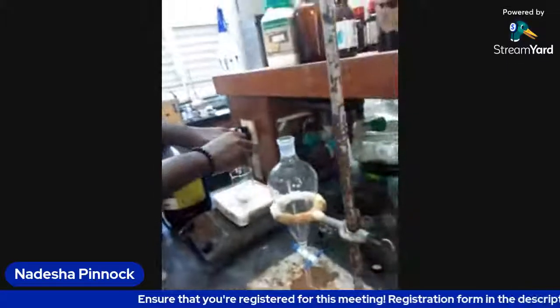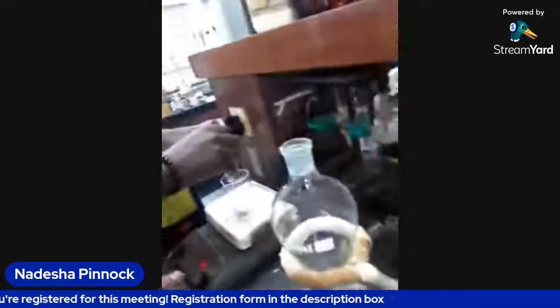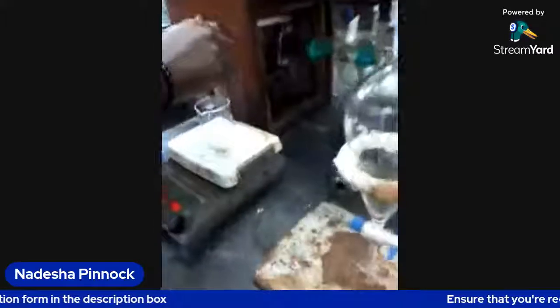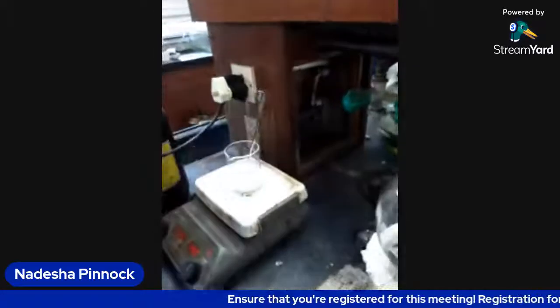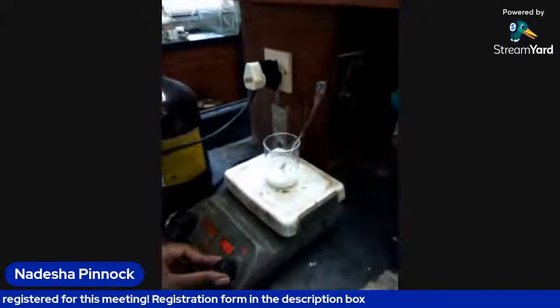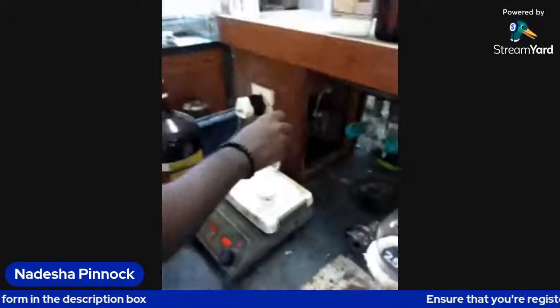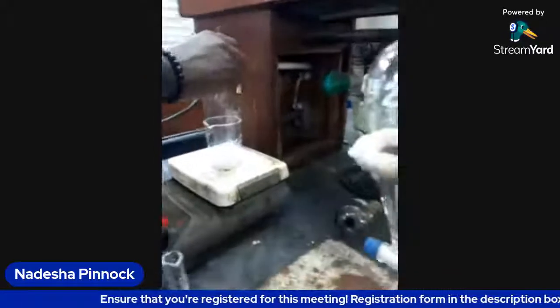So that's us adding the acetic acid, and it's on the hot plate. So we're just going to turn on the heat. When we're finished, the mixture should be white and opaque and kind of gel-like, right? After we get that gel-like mixture, then we're going to spread it onto aluminum foil and allow it to dry to get the bioplastic.